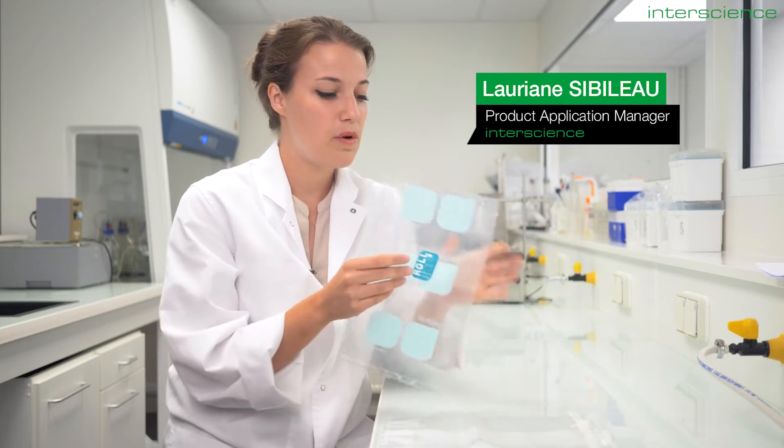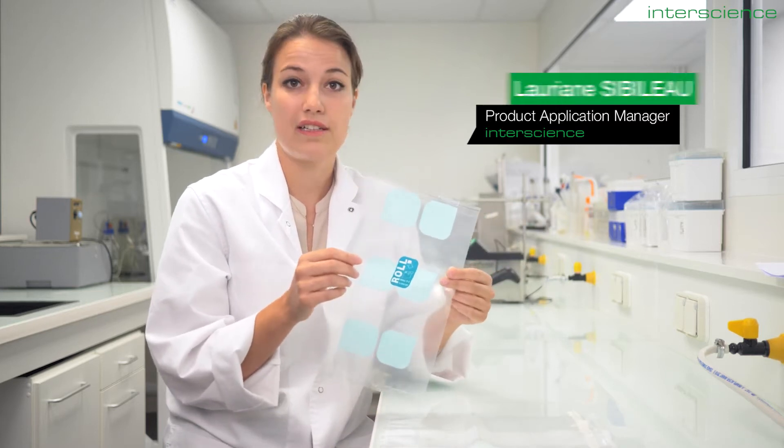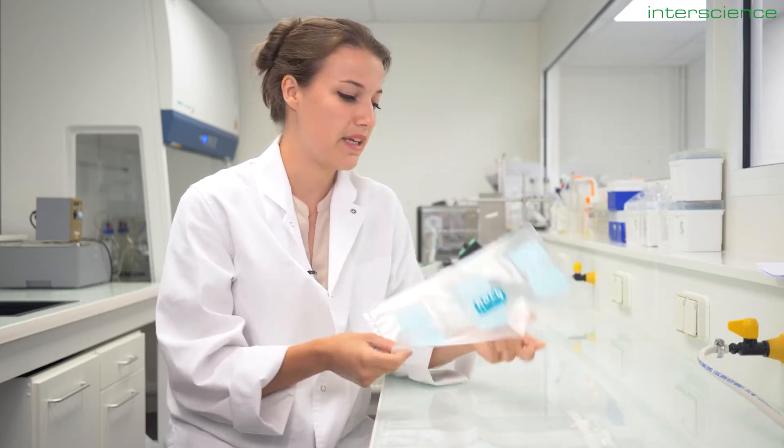Let's talk about the latest Interscience bag range. Roll Bag is a new take on our classic sampling and transport bag.